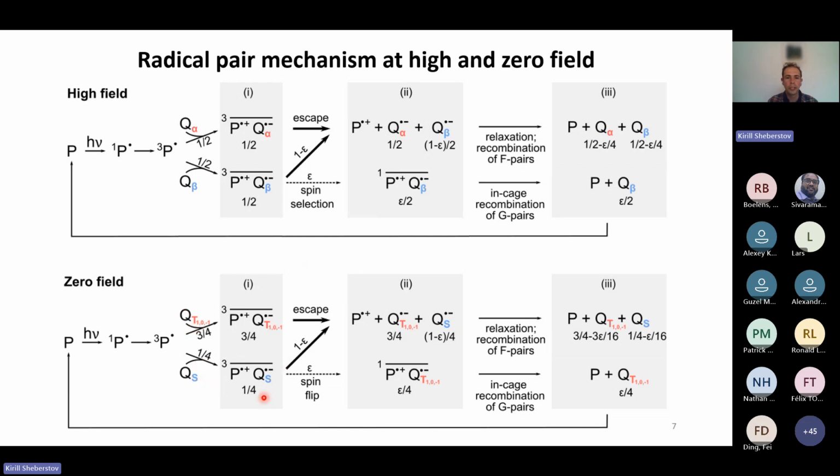And here we assume that the singlet state in the radical pair speeds up conversion from the triplet to the singlet state of the electrons. This process is accompanied by a spin flip from singlet to triplet for the nuclei. And upon repetition of this process, one gradually builds up an imbalance between triplet and singlet states. So this is exactly what we want.